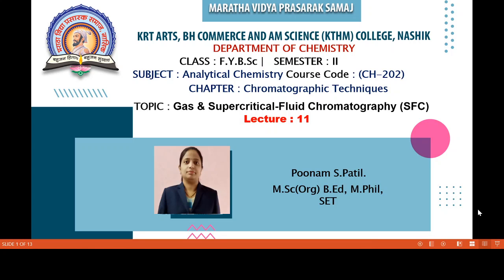Myself P.S. Patil. Student, in the previous lecture, we have seen gel permeation chromatography and affinity chromatography. These two terms we have already seen in the previous lecture. Now, in this lecture, we are going to discuss gas chromatography and supercritical-fluid chromatography. In short, we call it SFC chromatography.